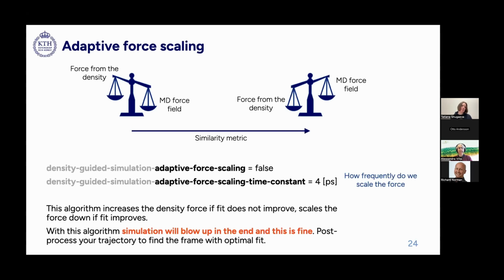But the idea here is that you run it and then you post-process it and pick the frame which you think gives you the optimal fit. And we will discuss this a bit more in the tutorial section.